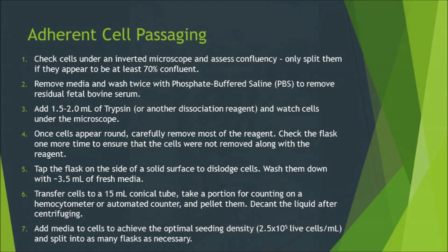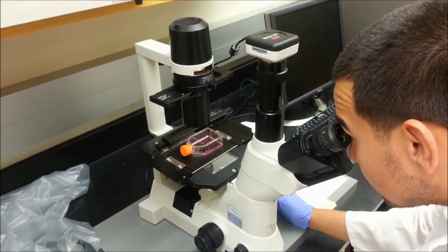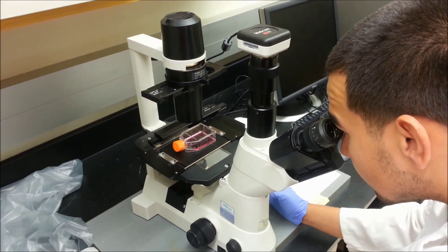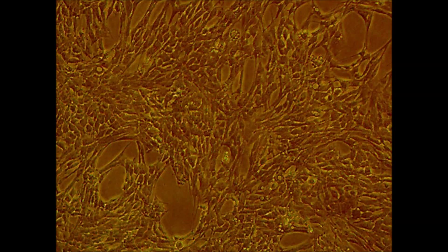Feel free to pause the video and take note of the step-by-step instructions for adherent cell passaging, but we will discuss these steps as we demonstrate the technique. Begin by checking the confluency of your cells under an inverted microscope. For adherent cells, they should look something like this when they are ready to be passaged.